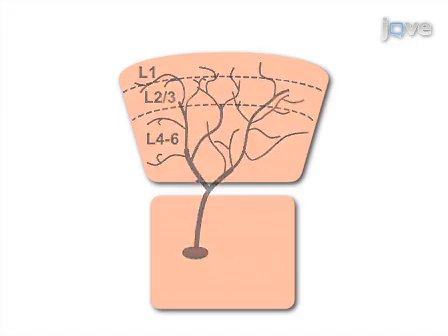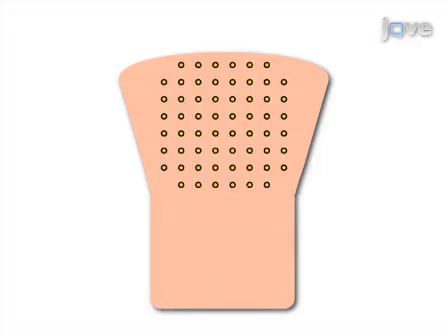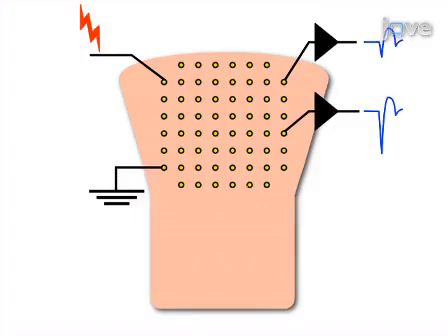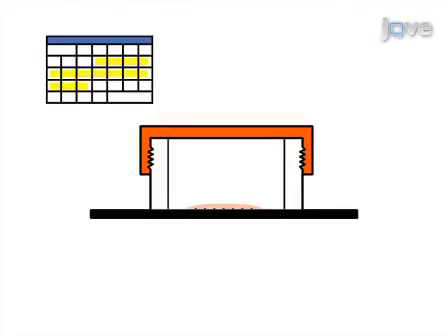As a second step, the cortex midbrain co-culture is grown on a multi-electrode array, which allows for multi-site stimulating and recording of neuronal activities in the culture. Next, we let the co-culture flatten, expand, and attach to the MEA surface during the first 1 to 2 weeks in a custom-designed incubator, which cycles the culture through exposure to normal air and culture fluid.